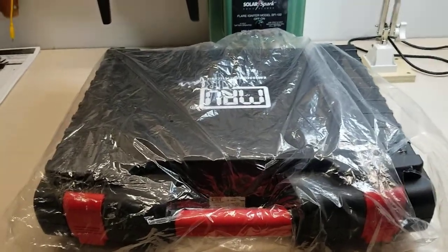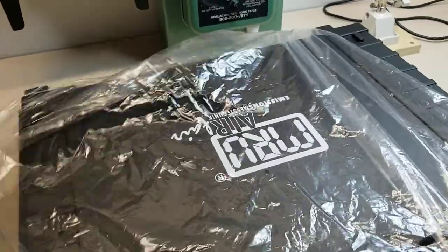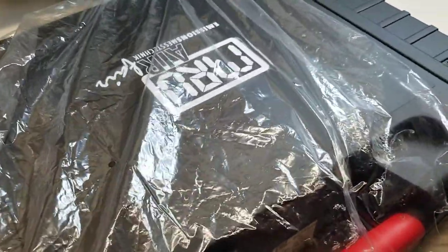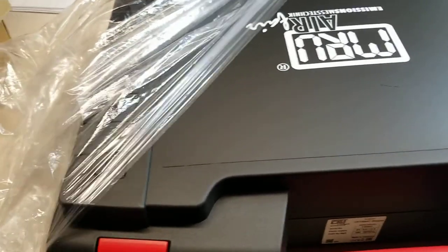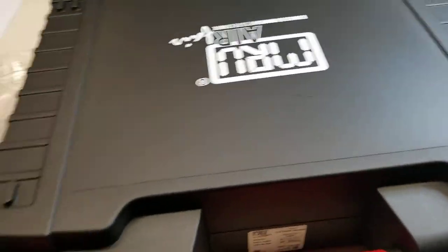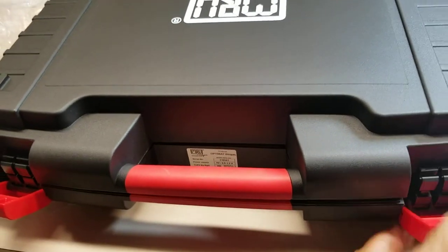Hi guys, it's Ray with Diamond Scientific and today we're going to unpack the MRU Optima 7 that was ordered by a customer that will be using it in a wastewater plant. It is a biogas analyzer — a nice option for wastewater facilities that want to measure and control their gas output.